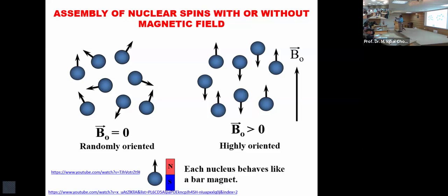Some of the species will go from low energy state to high energy state, absorption of radio frequency. And that was recorded. The first NMR was an absorption of radio frequency because of the presence of the magnetic field. The two energy states were defined.